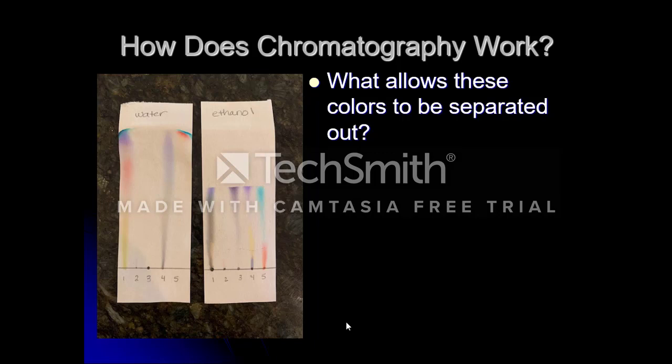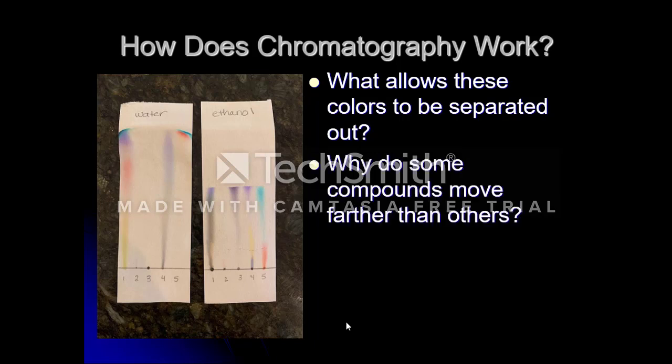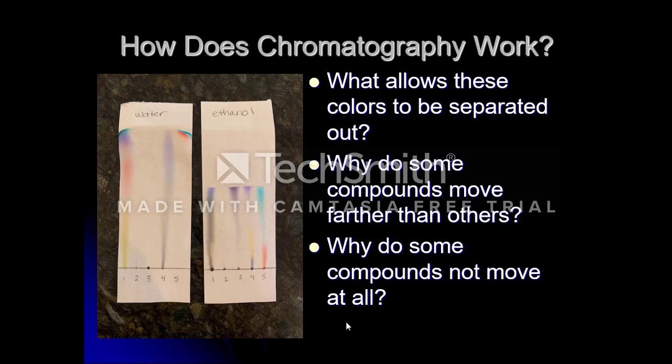It's made of different colors of ink. And so there are different things that cause the compounds to move farther than others, and that's based on the attractions between the liquid, either the water or the ethanol in our case, and the different colors of the different inks that are in the black ink.